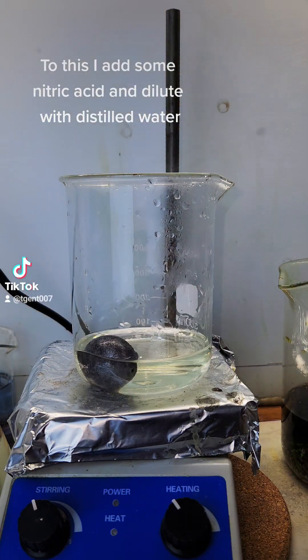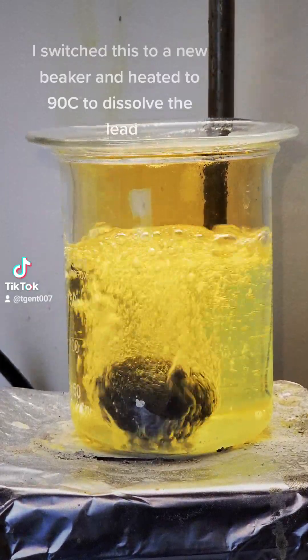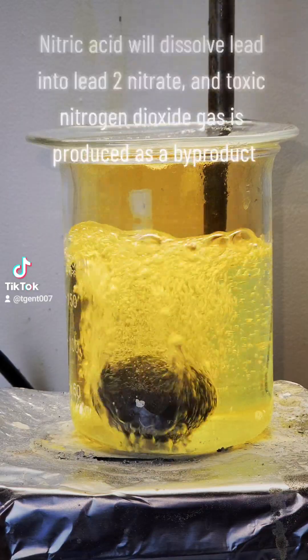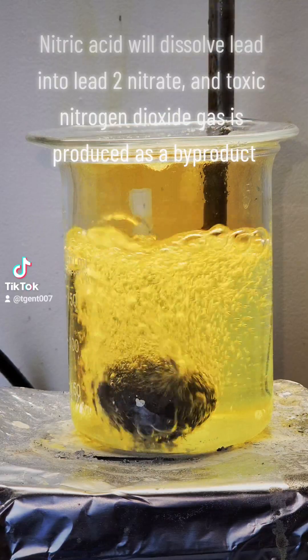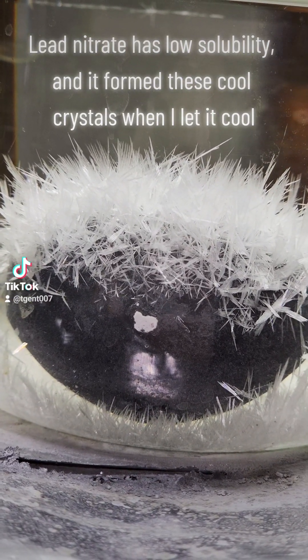To this I add some nitric acid and dilute with distilled water. I switched this to a new beaker and heated to 90°C to dissolve the lead. Nitric acid will dissolve lead into lead nitrate, and toxic nitrogen dioxide gas is produced as a byproduct. Lead nitrate has low solubility and it formed these cool crystals when I let it cool.